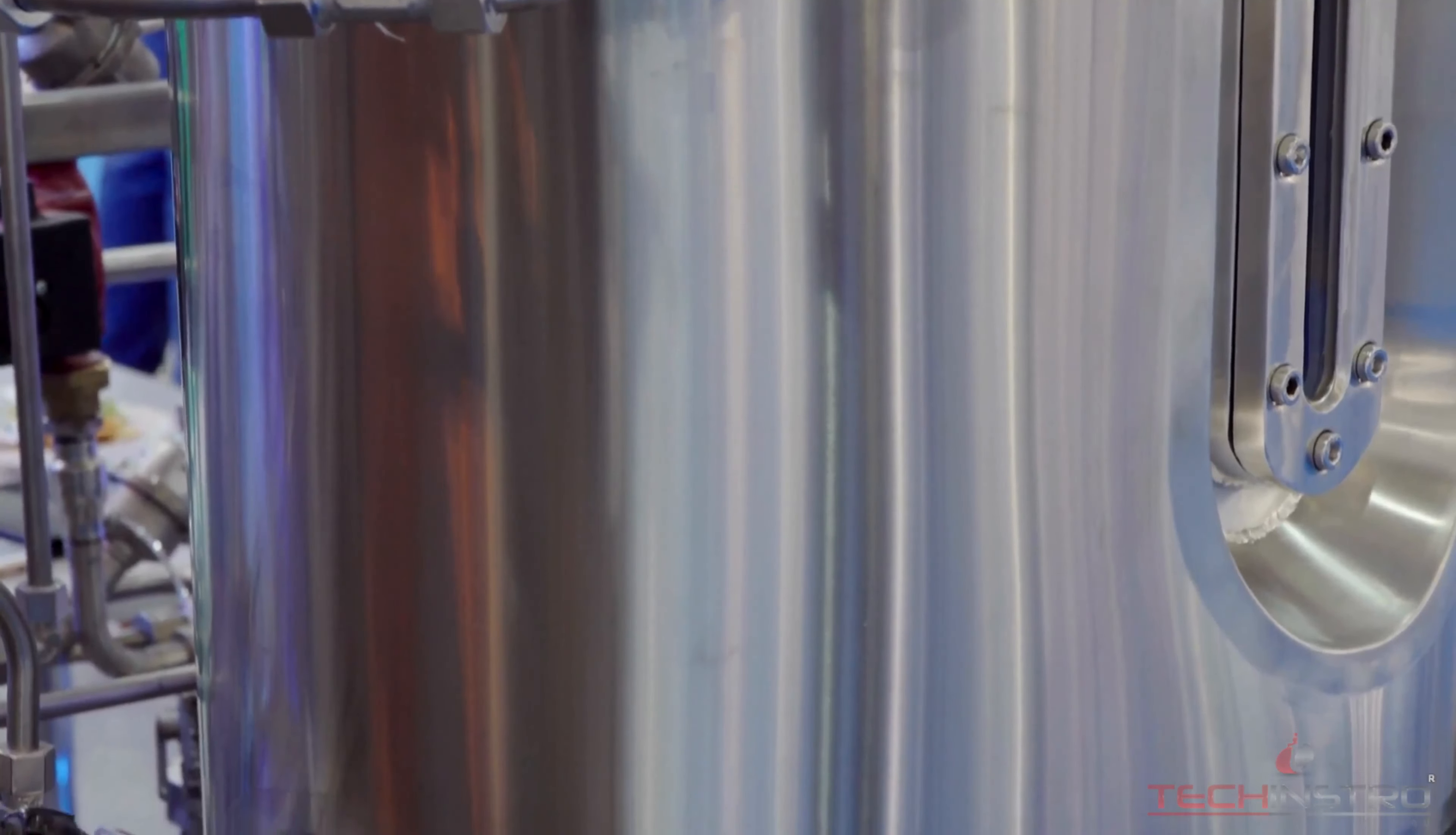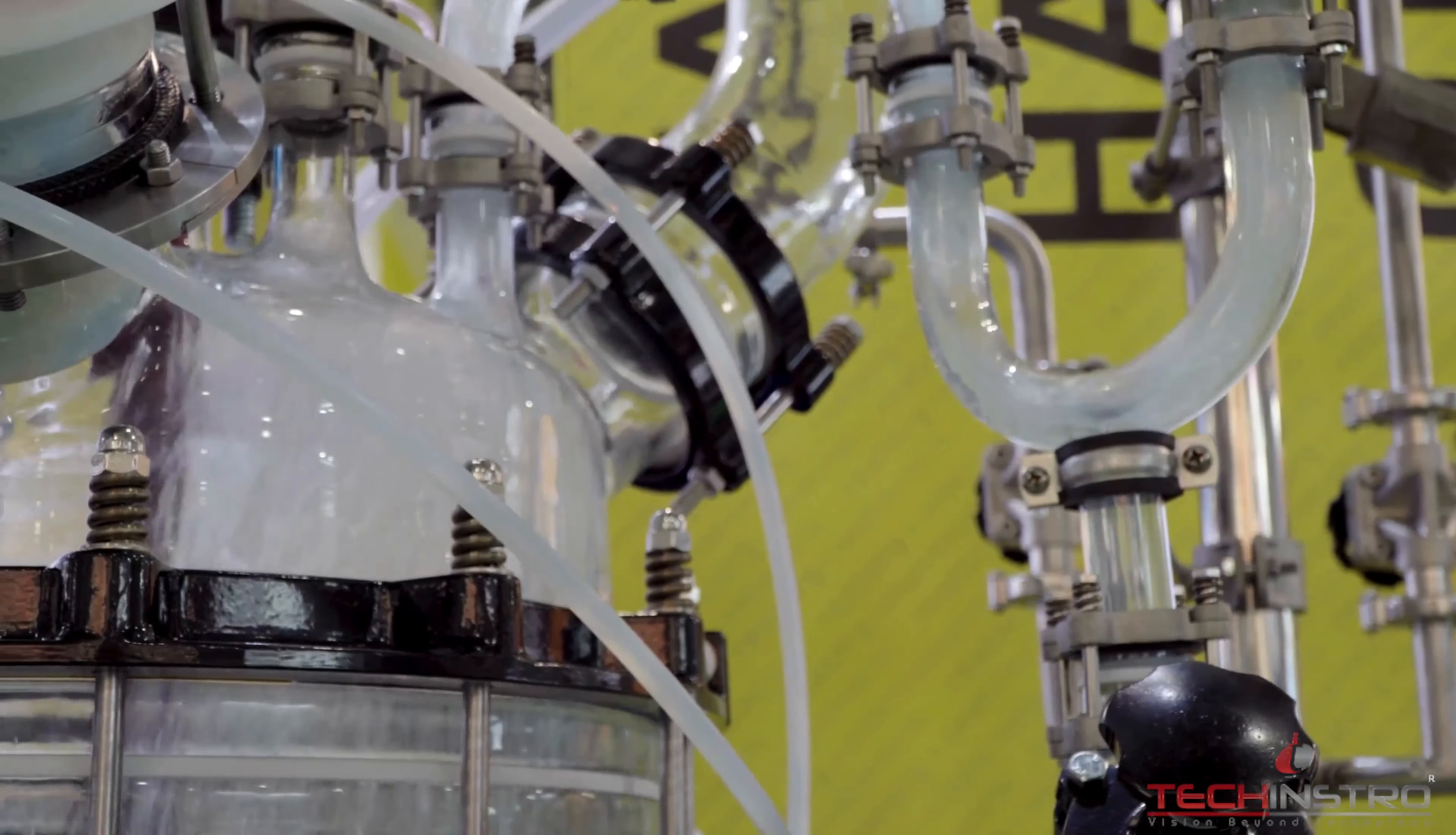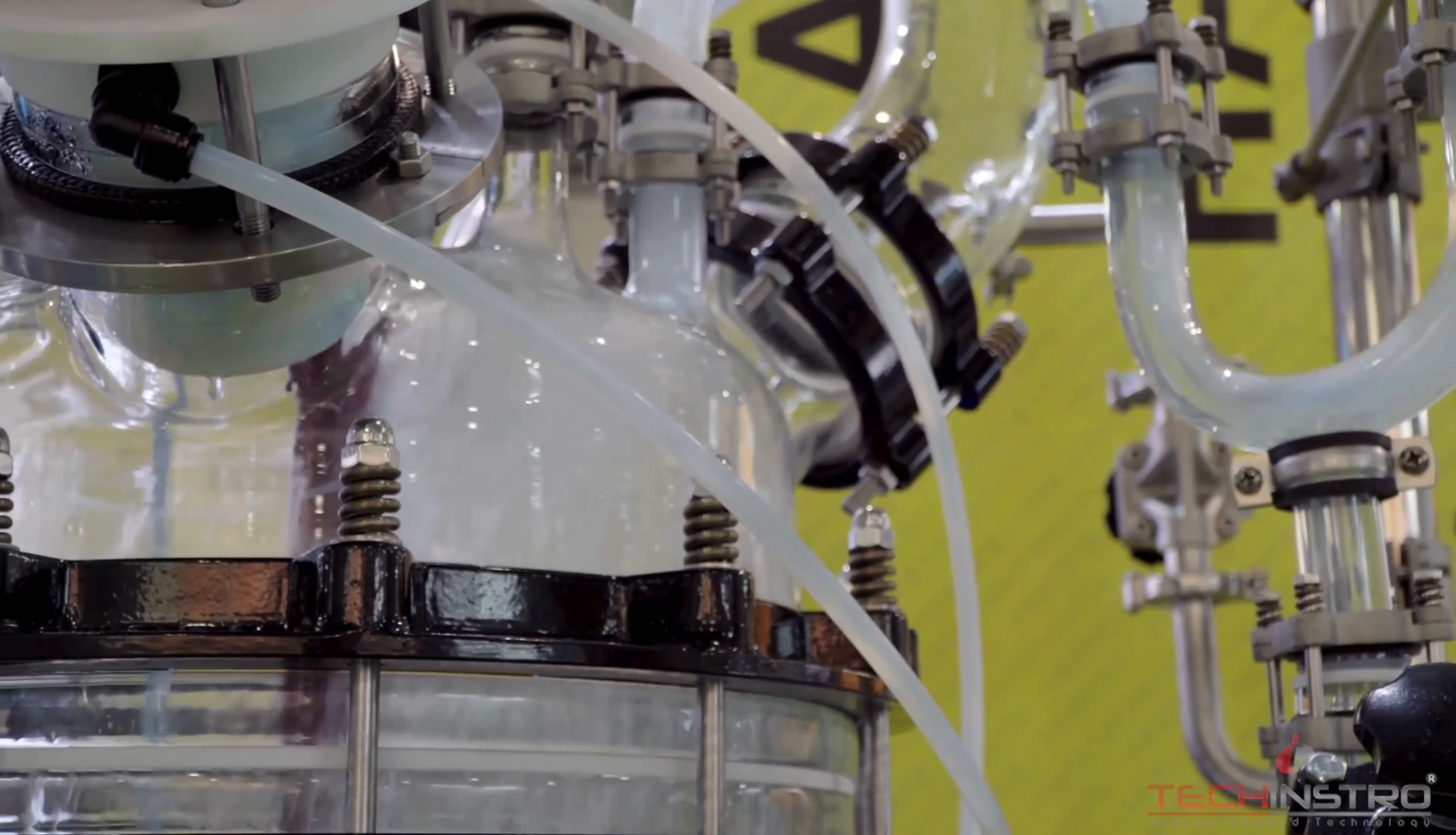The substances or reactants involved in the chemical reaction are loaded into the reactor vessel. This can include solids, liquids, or gases depending on the specific reaction. The autoclave reactor is sealed securely to create a closed system. This is crucial for maintaining the desired pressure and preventing the escape of reactants or products.